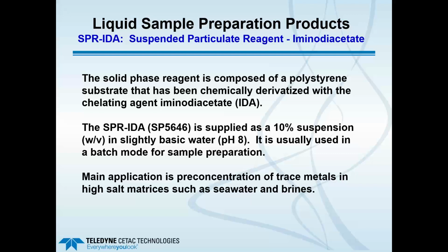It is typically used in a batch mode for sample preparation, meaning it's typically used offline, not online as with a column. The main application is going to be pre-concentration of trace metals in higher salt matrices, such as seawater and brines.